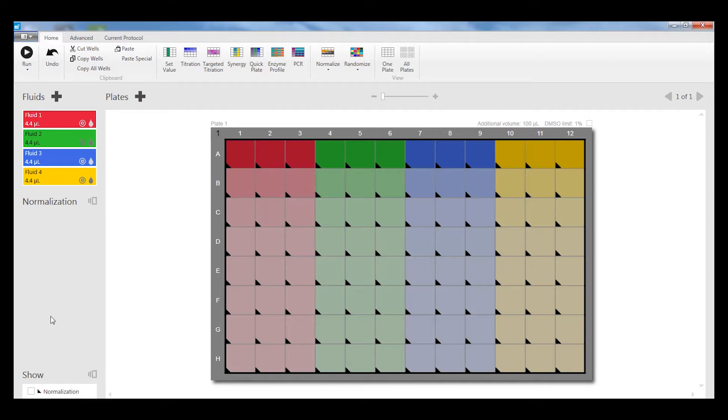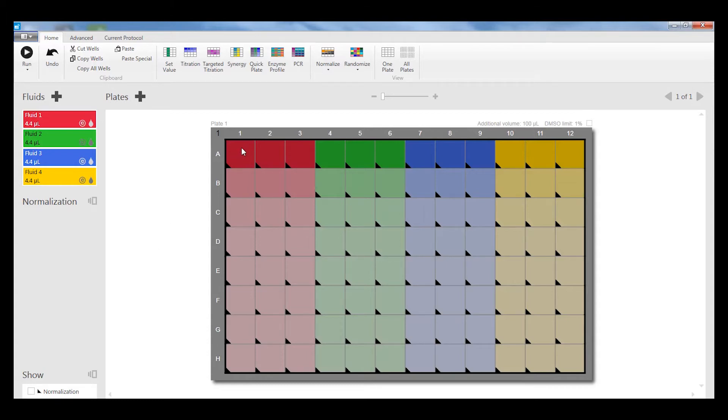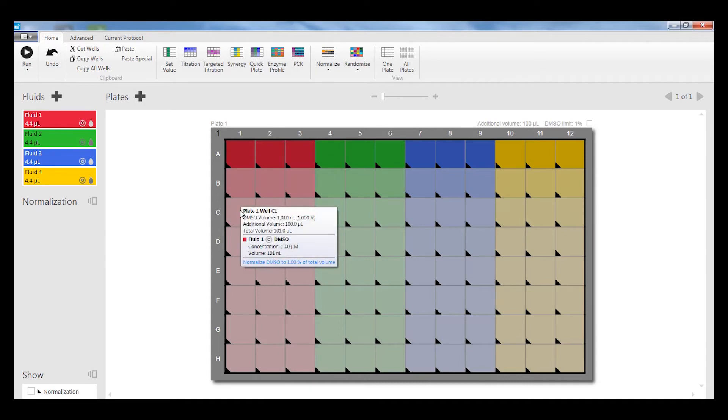The next thing you might want to do is to randomize the design. When there's edge effects in an assay, particularly for cell-based assays, you don't necessarily want to have the concentrations being distributed in the way that's shown here, so that all the high concentrations are at the edge.